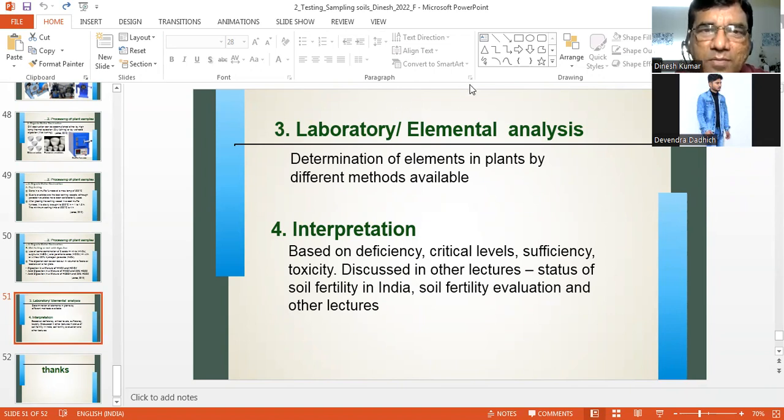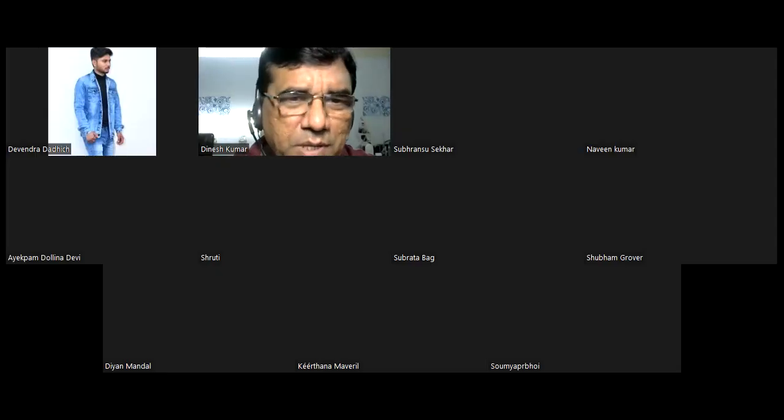So any question from this practical? This is a kind of practical where preparation of soil sample and plant sample was discussed. So we go to the last link.